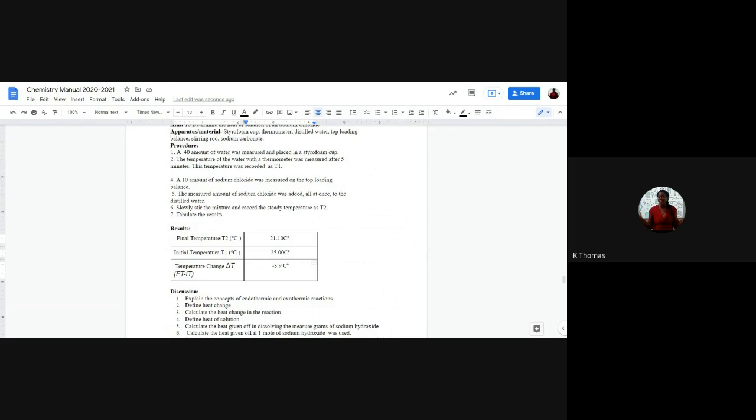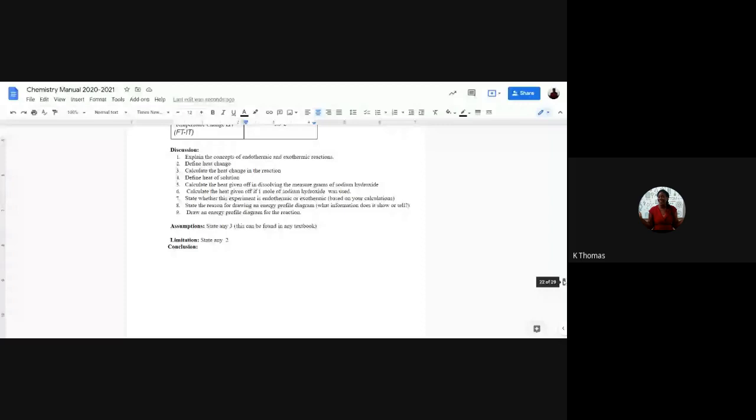Alright, so that's it for the lab. Now it's time to do my calculations.